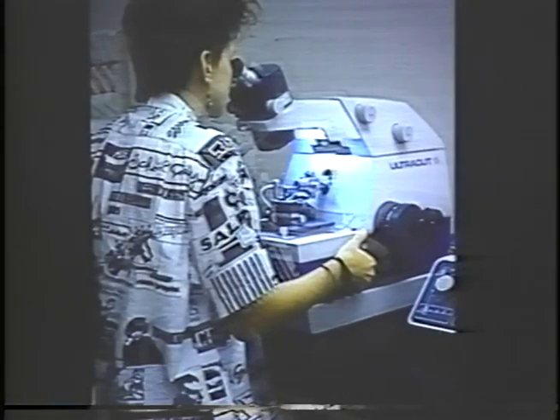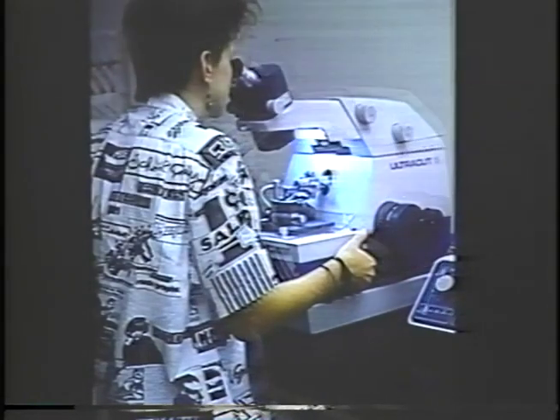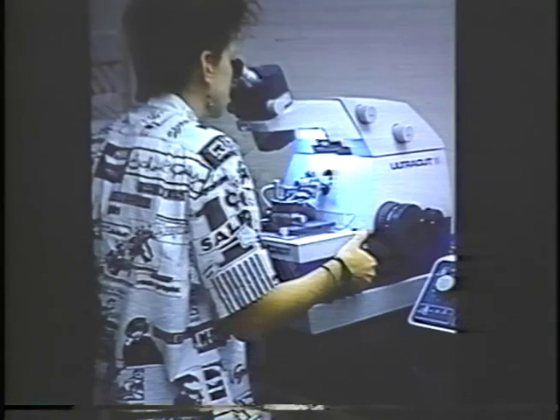Oh, here's a stereo pair of Janet Meal at the ultramicrotome. Now, what I'm going to say may sound facetious to you, but it's really not. There is a karma, a mindset to serial sectioning. When I'm going to do some serial sectioning, I try and psych myself up starting a couple weeks ahead of time. I try to put myself into a good mood. I try to pump myself up like an athlete getting ready for the Super Bowl.